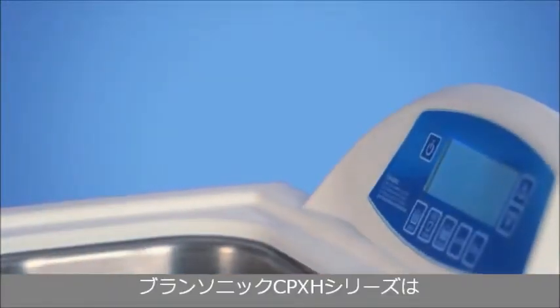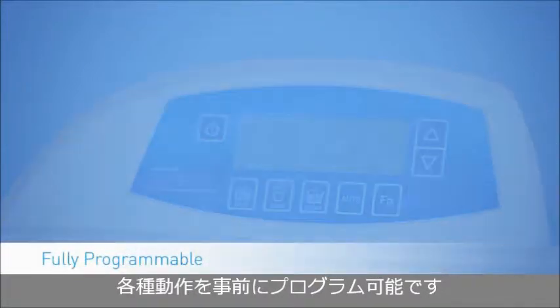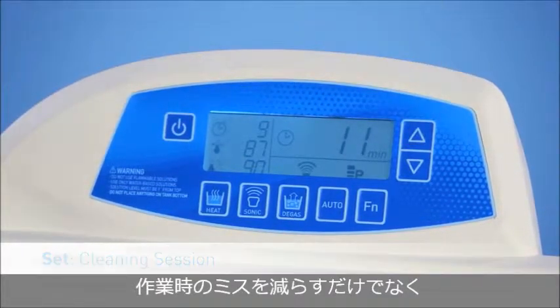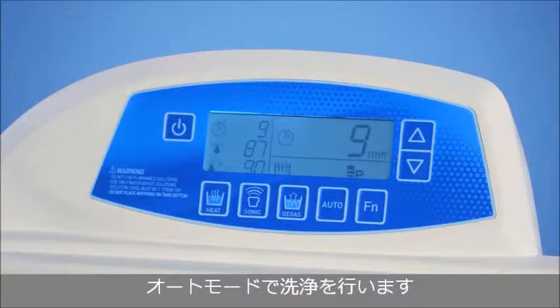The Bransonic Digital CPX-H ultrasonic bath is the only bath that is fully programmable. The digital display allows users to program and lock in the cleaning settings for their session. It not only helps reduce operation errors, but it also allows for autonomous operation after the bath is programmed and the cycle is started.